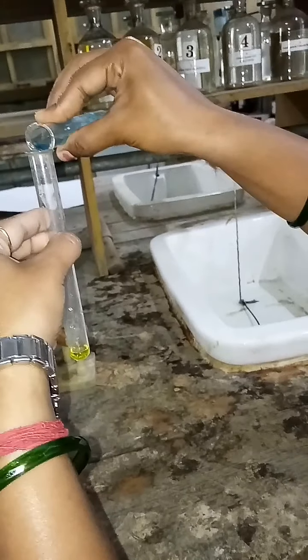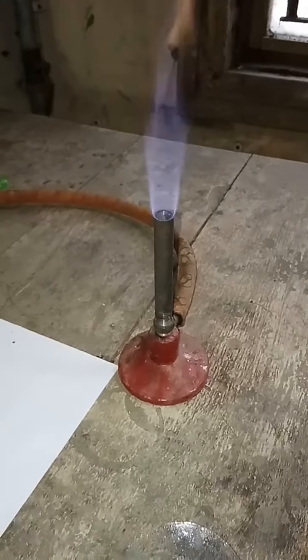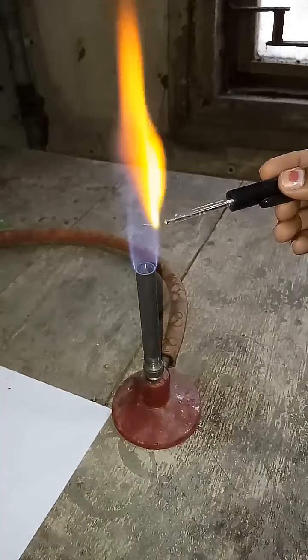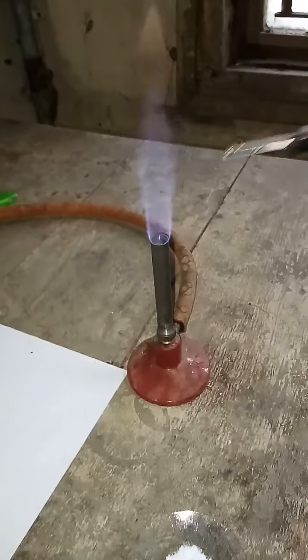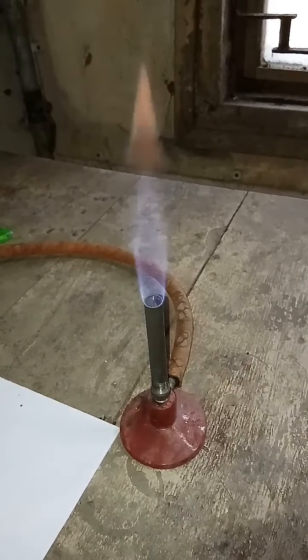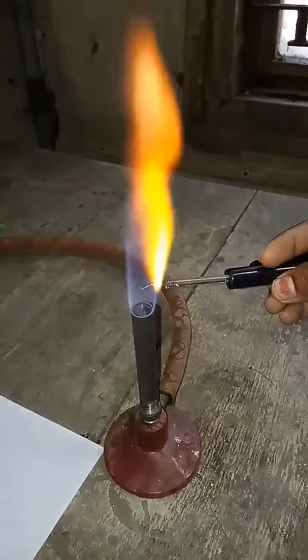Next we have the litmus test. First I will take blue litmus paper and dip it into the OS and check. As you can see, your blue litmus paper turns red. I will check with the red litmus paper, and you can see there is no change. So in the litmus test, your observation is blue to red, which means salt of strong acid and weak base is present.